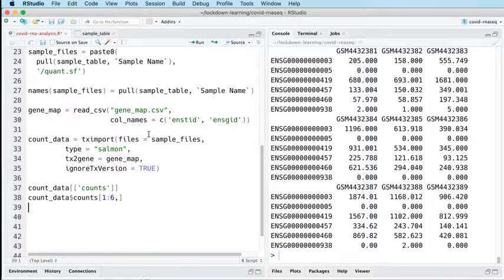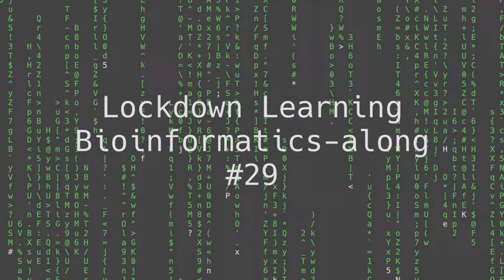Okay, so I think we've done well today. I probably shouldn't have started going through that on Friday, but we could take a step back today and get it done properly. So I'm pleased that we've done that. So yes, that's all for today. Hopefully that's been useful, and hopefully everybody's with me and has got the data in R now, and we're ready to go with the next stage.